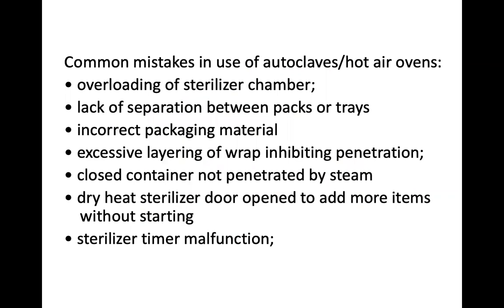Some of the common mistakes that people make with ovens and autoclaves. An autoclave uses the moist heat, the steam, while the hot air oven uses dry heat. It is just like the conventional oven that you use for baking in the kitchen, but for a sterilization chamber, it's an oven that can go to a much higher temperature.